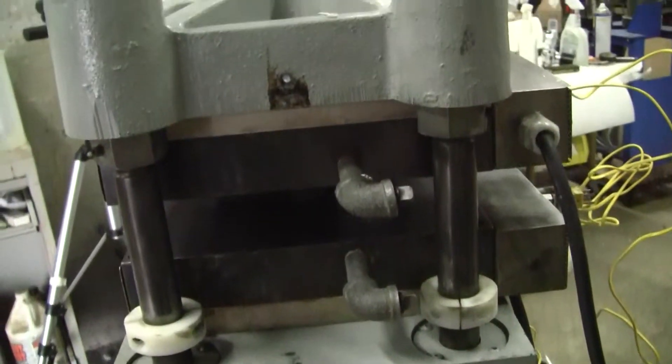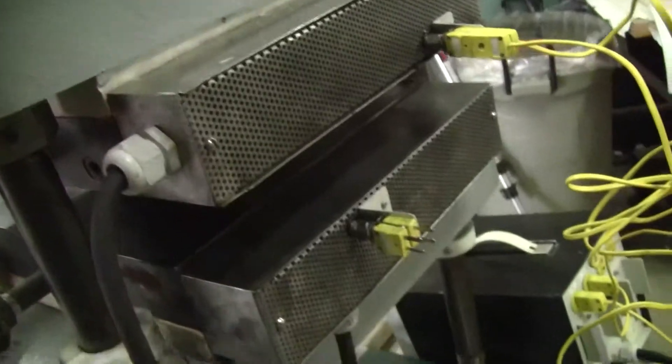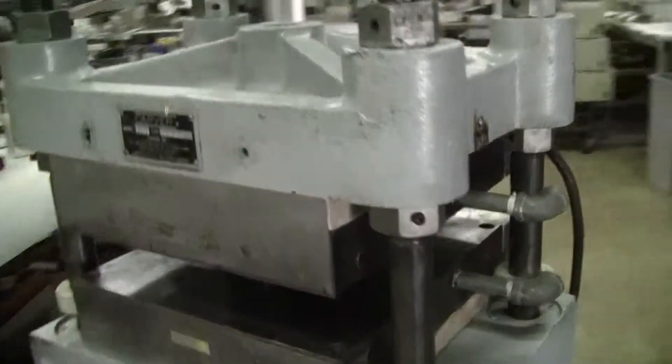There's your cooling. I have just one of the connections hooked up. There's your rear of the controller. You will need 220 volts, obviously, to operate it.